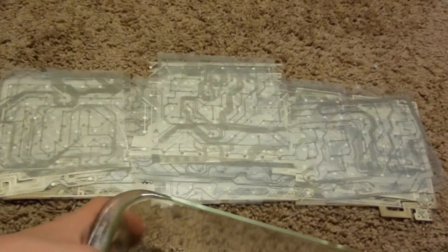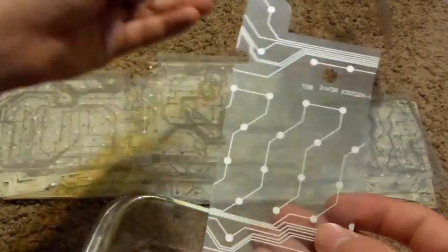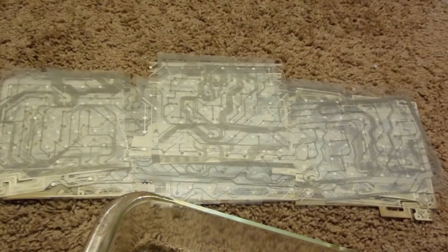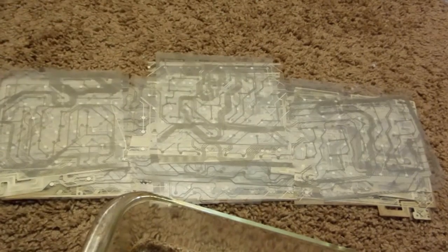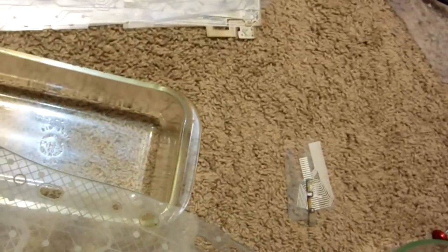In this case, I'll need to cut each mylar into six pieces in order to fit them inside the little rectangular dish. I'll have to make it about this size with a pair of scissors, so you can see the size comparison. And you just use a pair of scissors, like I said. Yeah, it's pretty simple and straightforward. I cut away any loose pieces of mylar and any parts that are sticking out. I don't need to deal with that piece, as it's already small.